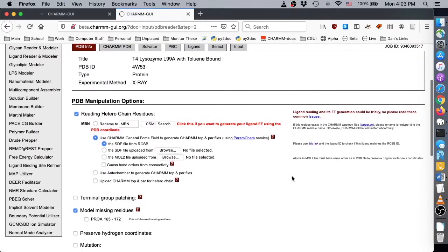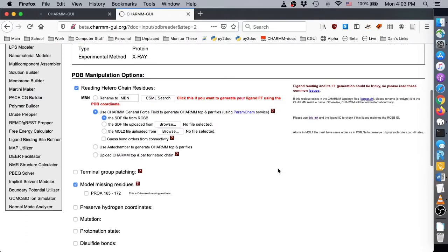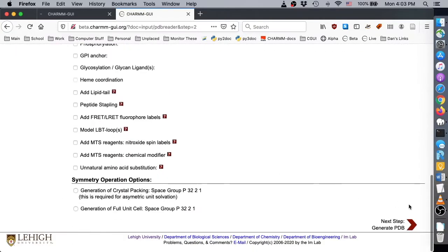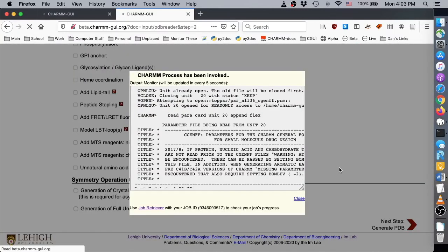On this page, we see the options for manipulating the PDB structure and reading engineered residues. For a more in-depth explanation of how to use the options on this page, please see the PDB Reader video demos. For our case, we can simply leave everything at their default values and click next.